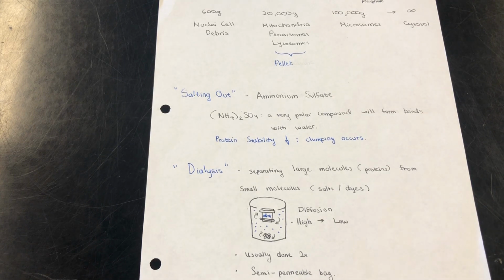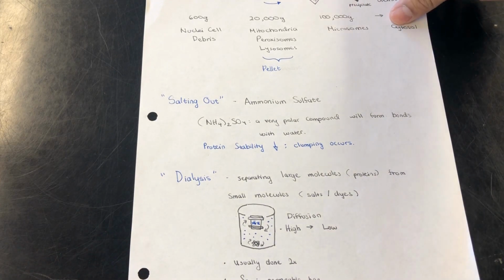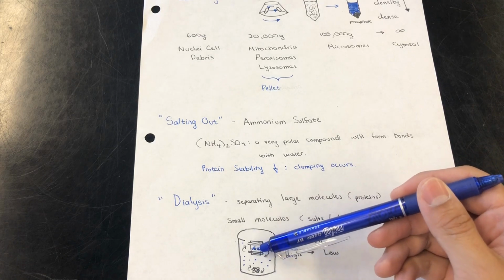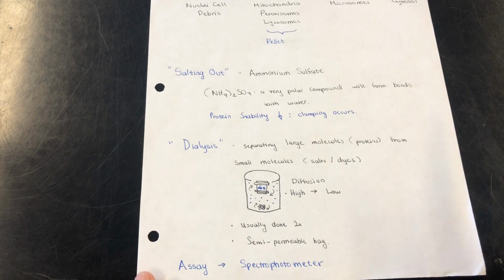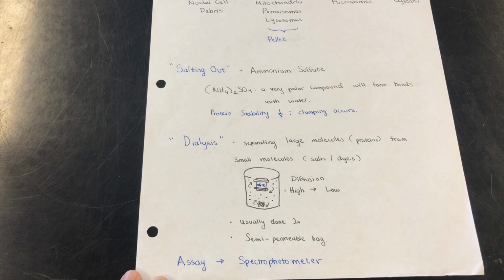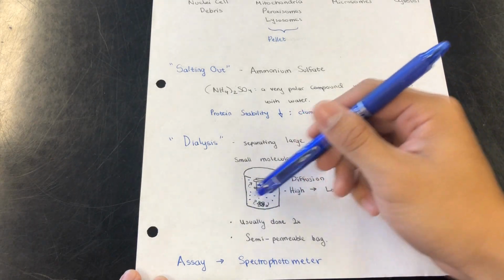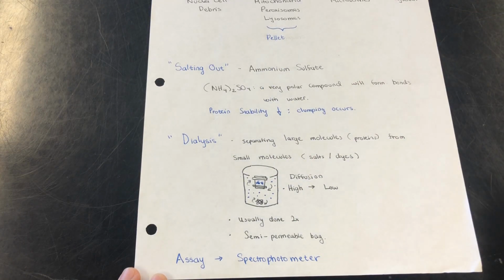So the next step is dialysis. Dialysis is separating large molecule proteins from smaller molecules, such as salts and dyes. You put your protein or enzyme of interest inside this semi-permeable bag, which is made up of things like snakeskin or anything it could be. And it's clamped. Inside this beaker, you have a spinner spinning, and you have dialysis buffer solution.